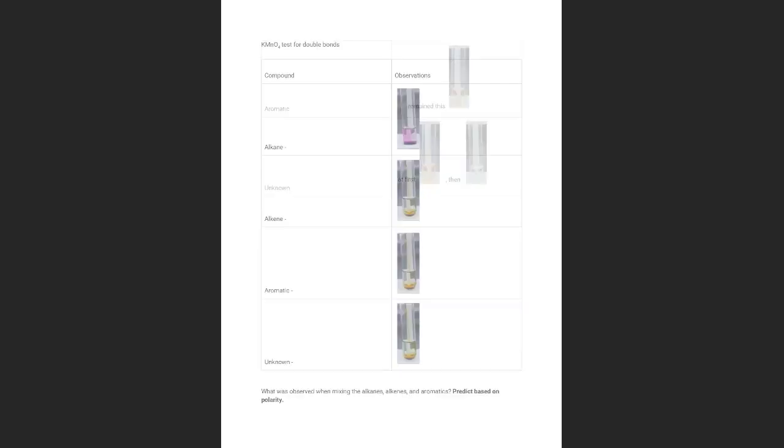And the same way you are going to complete. And then you will have to complete the permanganate test for double bonds. So the permanganate is purple. So you are going to add, it will be the same thing. If the purple stays, the reaction is negative. If the reaction is positive, so the alkane is giving us a negative.